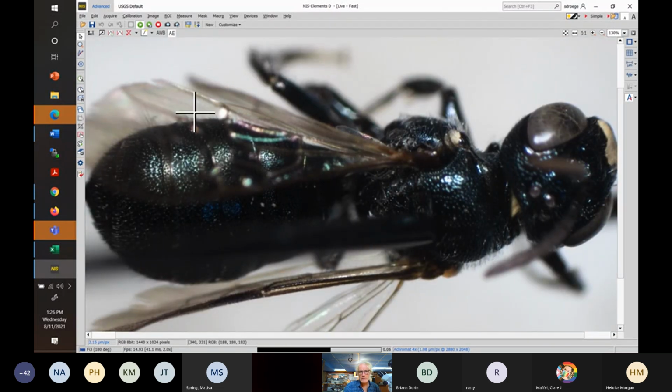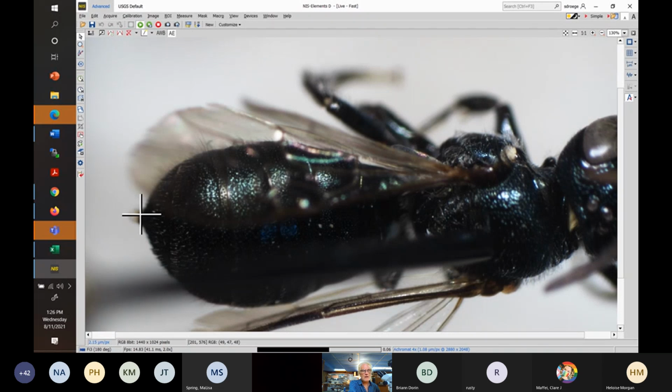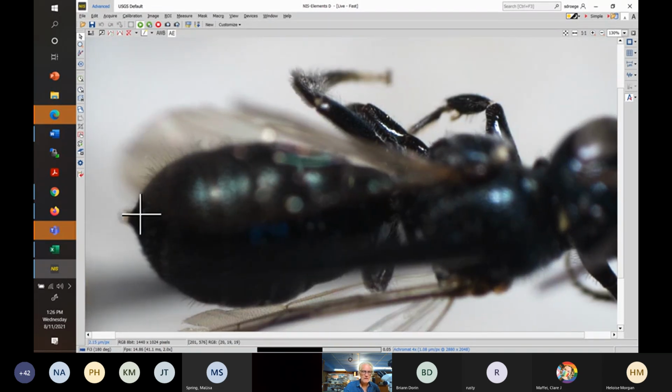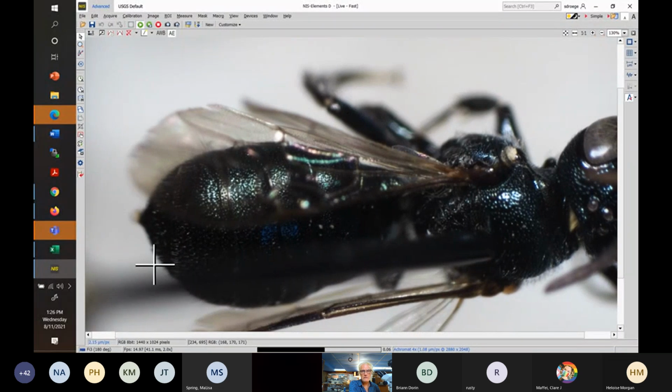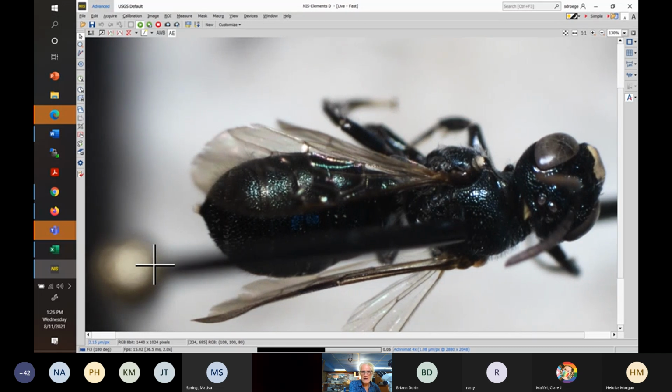So here we are, roughly parallel-sided water bottle abdomen, not that many hairs. There's the T-shaped marking of a male. I'm going to show that better in a second. We can't see it right now. This exists in all the males. I can't remember if it's on the females. This little tuft of hairs and a slight point, that might be on the females too. It really doesn't enter into ID though, but it's just another part of this Ceratina package that makes them pretty easy to spot.